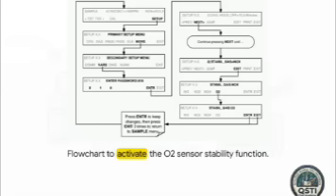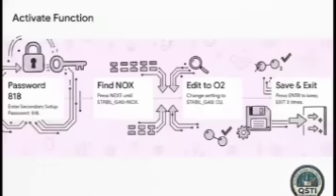And just a heads up, getting to this specific setting requires a bit of security clearance. You actually have to dive into the secondary setup menu and punch in a passcode. Breaking that interface down to its core actions, once you get that prompt, you're going to enter password 818. That's your key to access the deeper variables.